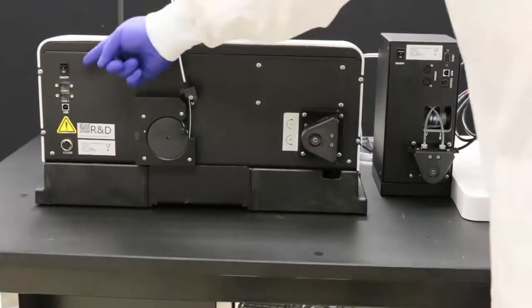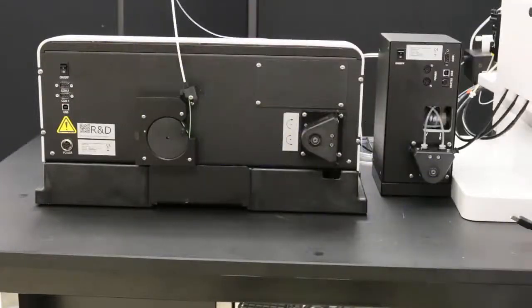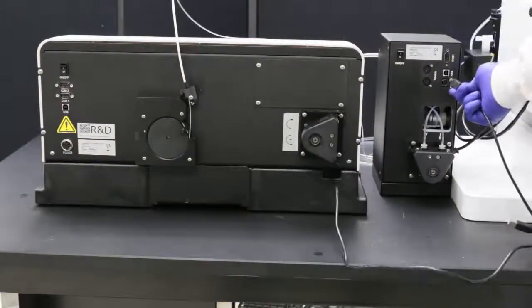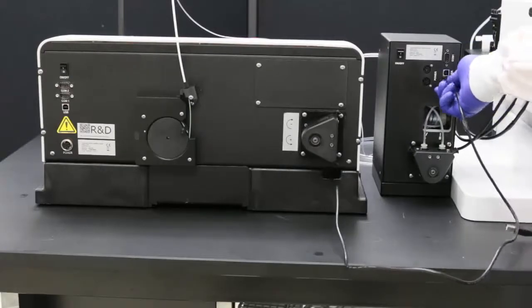Make sure the power switches on the back of the SDX and on the back of the auto sampler are turned off. Connect the vortex cable to the vortex connector on the back of the SDX pump module.